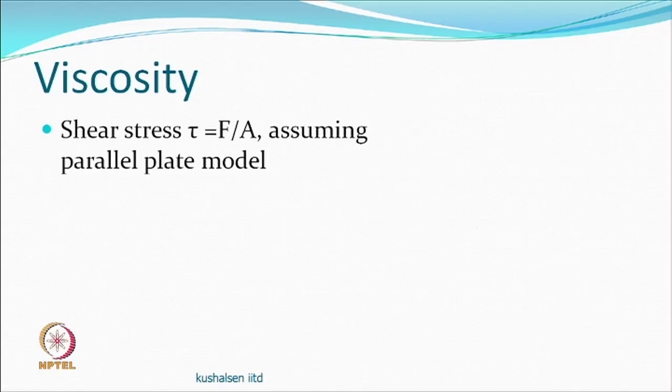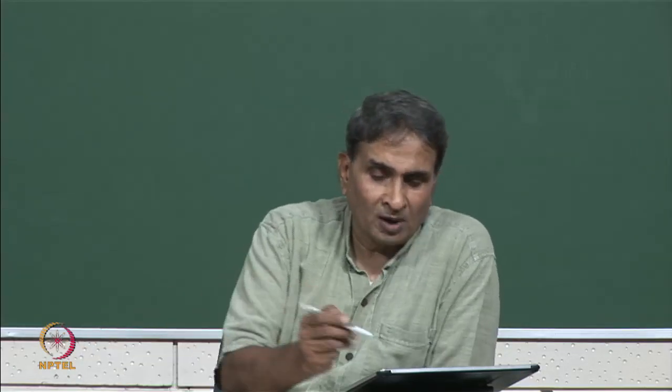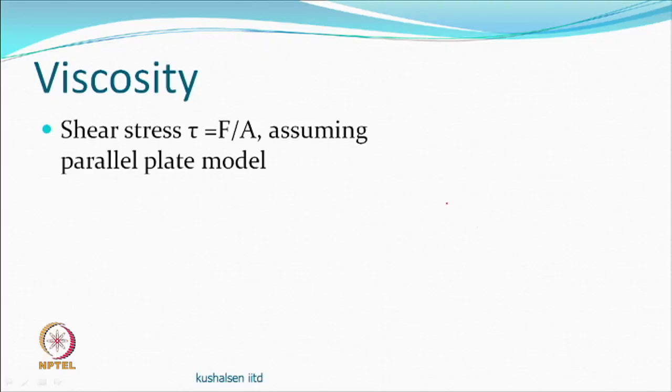So, from our point of view, viscosity, as you may have understood earlier also, is basically layer by layer there is a shear happening in a system. The way it is defined is, you have a shear stress. The parallel plate model may be represented something like this.